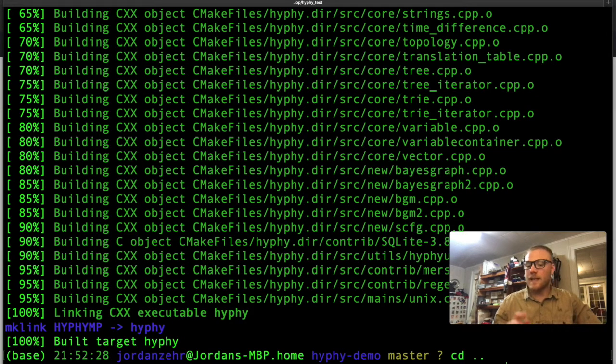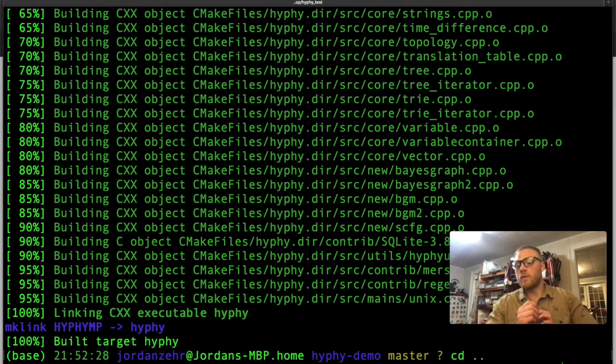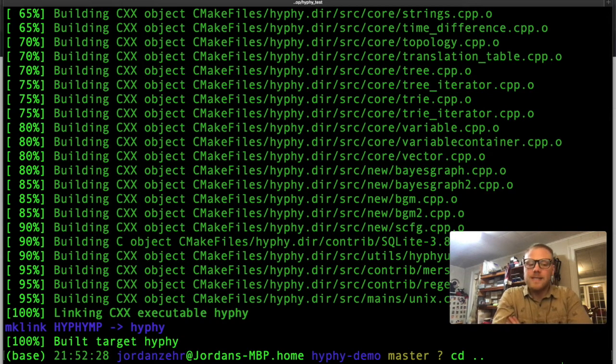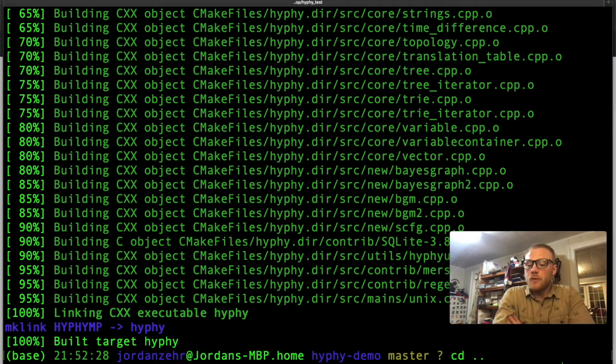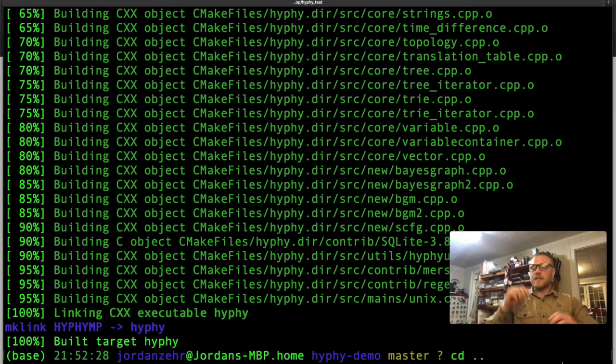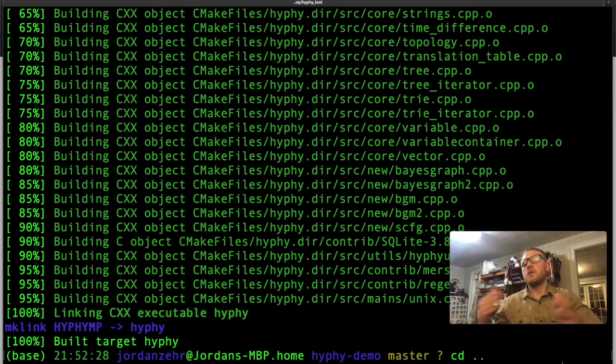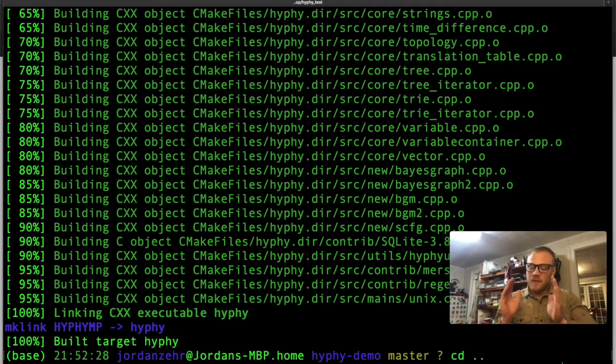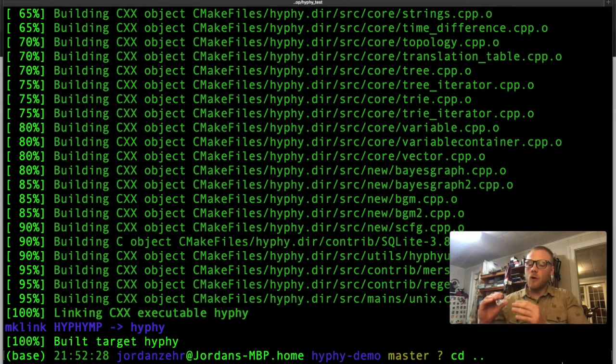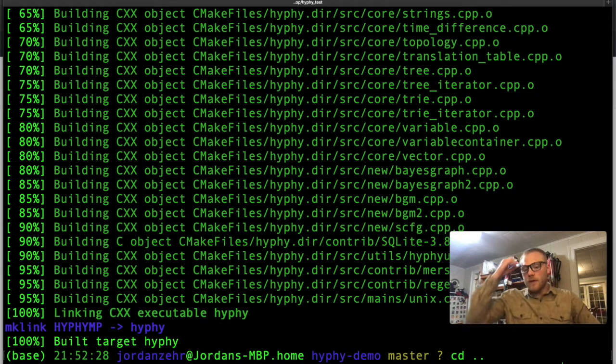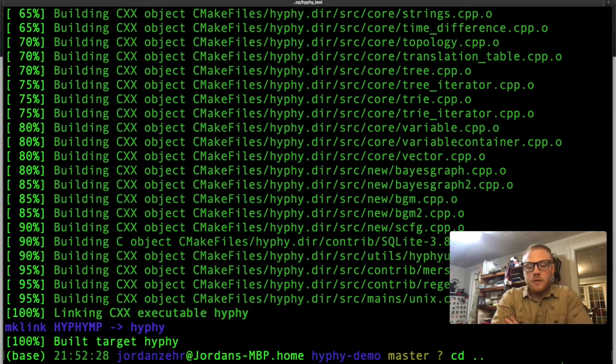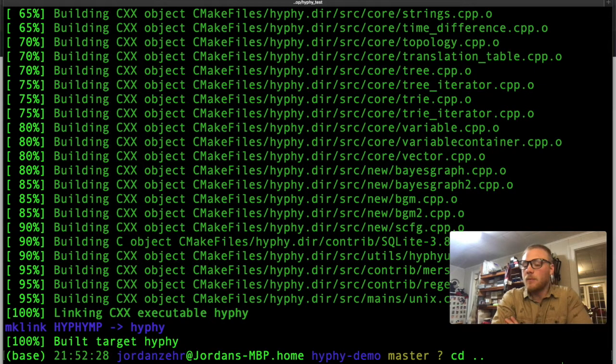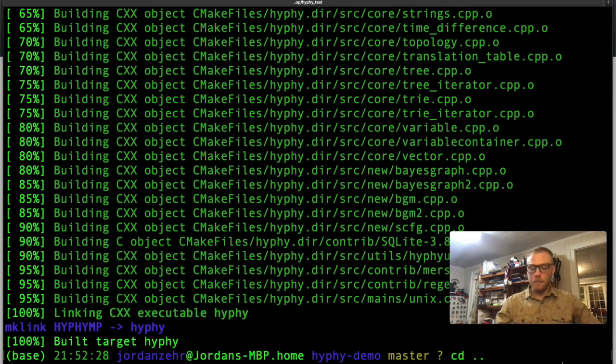And now remember I said that lib path is very important. So we're going to set a lib path here. And the reason that the lib path is so important is that you can change whatever version of HyPhy you want to run. And you do that essentially by changing this lib path variable. So what you can do is set a different lib path where you want HyPhy to run from, an older version of HyPhy, a newer version of HyPhy, whatever the case may be. But this full path explicitly says, HyPhy, I want you to run on all the batch files from this particular directory. So that's very important. And if you're running HyPhy for the first time and you're running into some errors, check your lib path because 95% of the time, that's probably what's going on. And it takes five seconds to do it. So without further ado, let's do that.